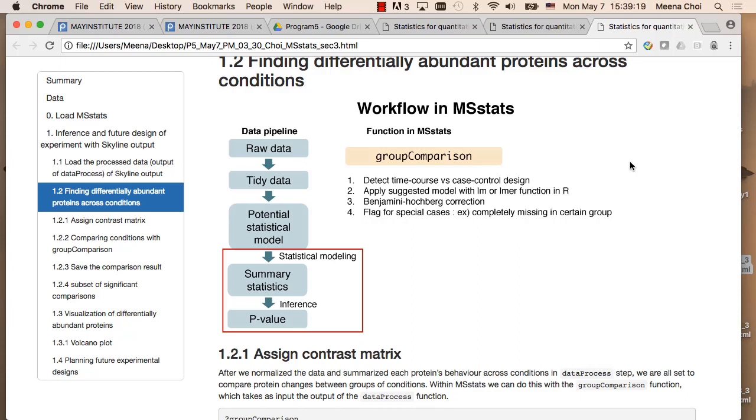For example, there are more than 2 conditions, and actually there are 3 points for each feature. So based on our filtering strategy, we have 3 measurements across the MS plot. So we passed, and then we keep this.